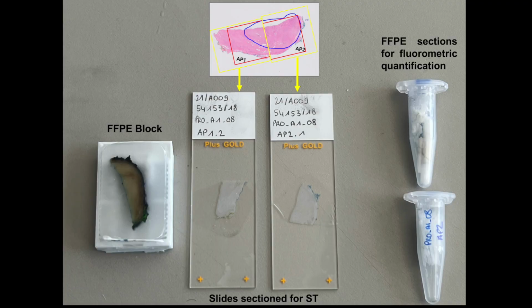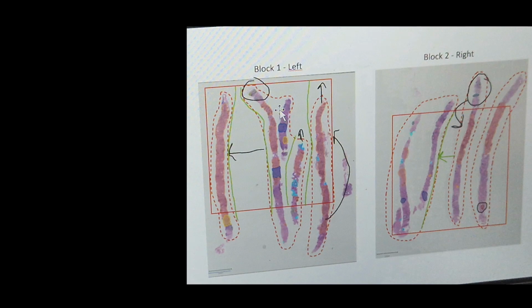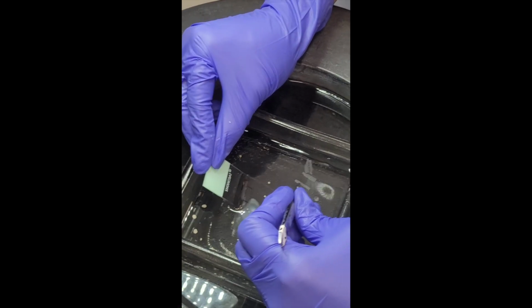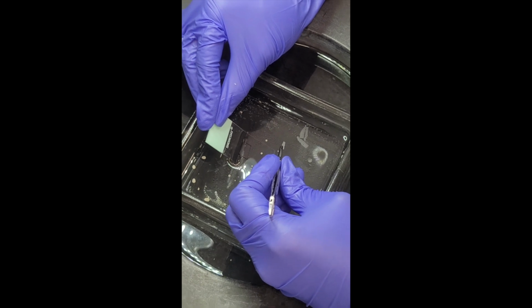By following this video protocol, you should achieve slides as shown here, reflective of the digital schema, optimized for spatial transcriptomic sequencing. Next, we will move on to the preparation of prostate biopsy and lymph node specimen. The linear structure of prostate biopsy cores require more extensive planning and technical expertise when mounting to ensure optimal sequencing coverage.